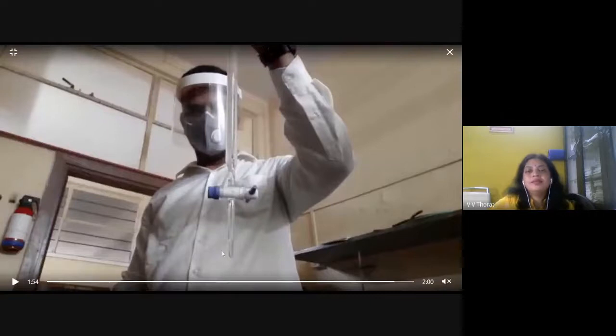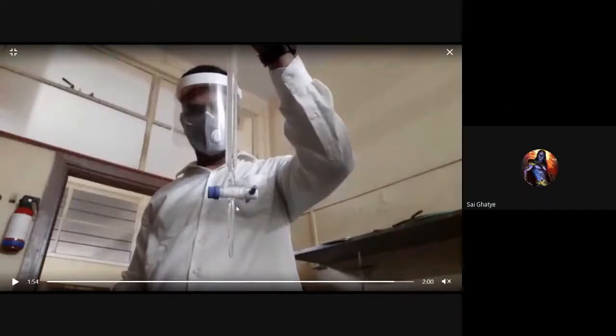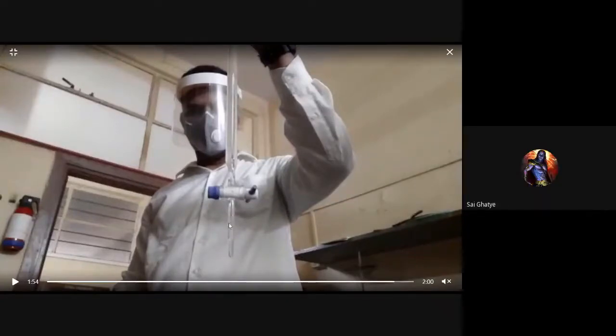What is there on your screen? Sai, tell me the second precaution. Second also you tell. Second also air gap, tell. Air gap. Yes, very good.